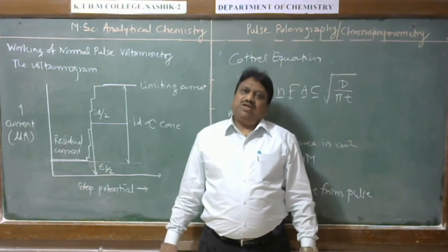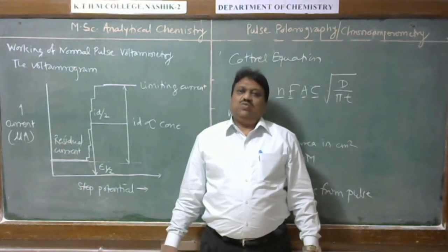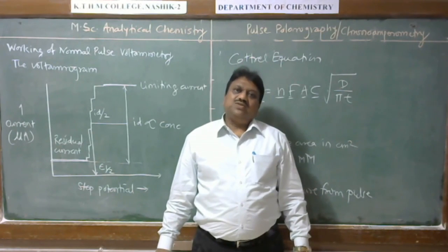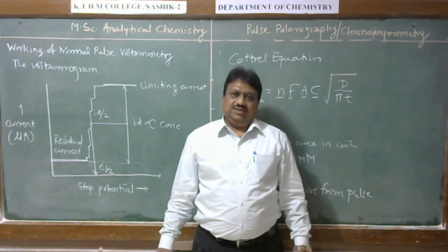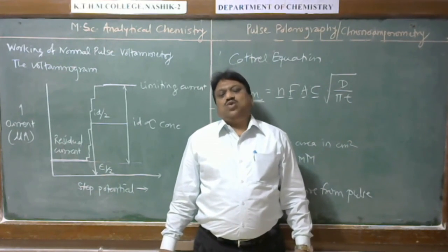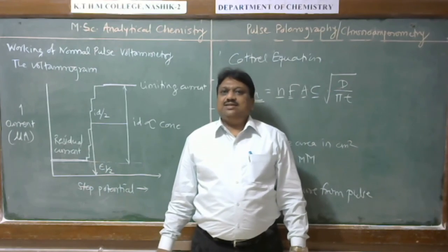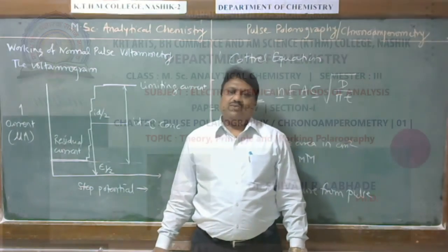Student, from our today's discussion you will find the answer of following question. Question is like this: what is pulse voltammetry and what is normal pulse voltammetry? How does it work? With this we stop here. In forthcoming lecture, we will discuss the another pulse voltammetry technique, that is a differential pulse voltammetry and square wave pulse voltammetry.